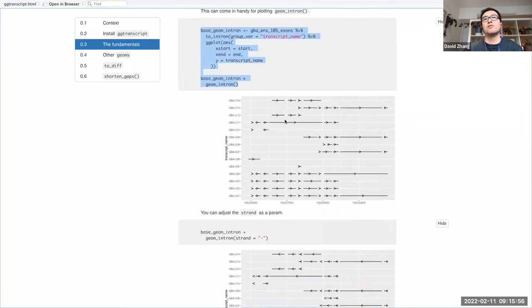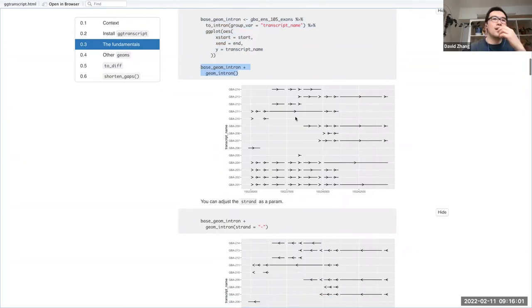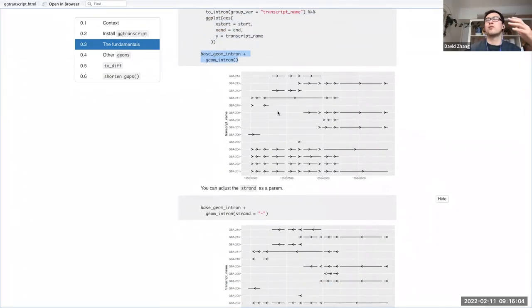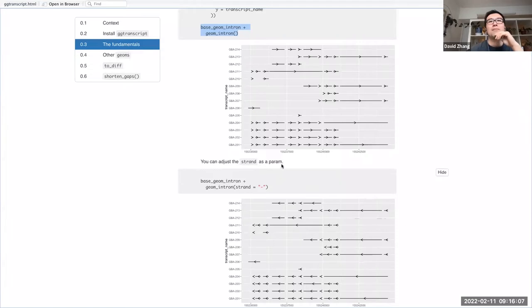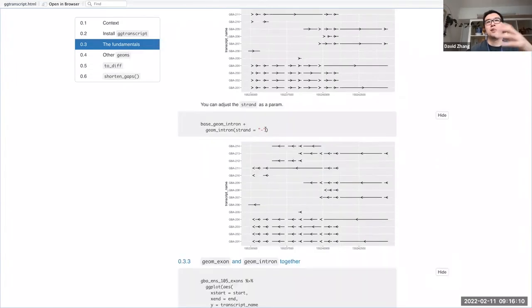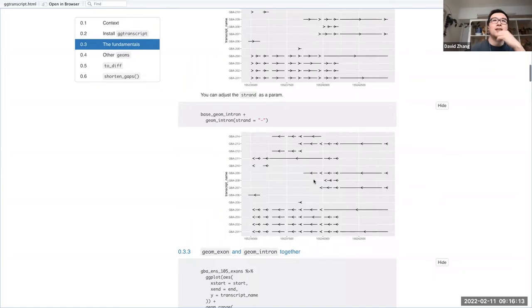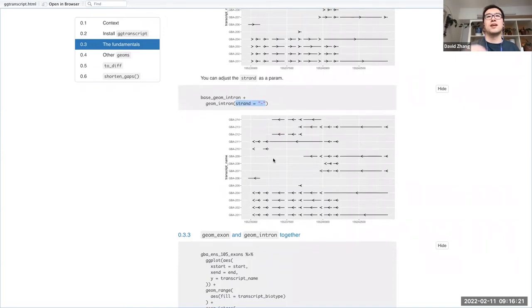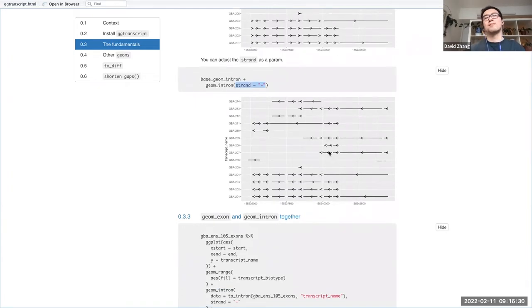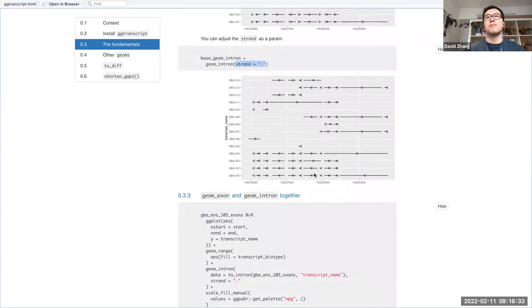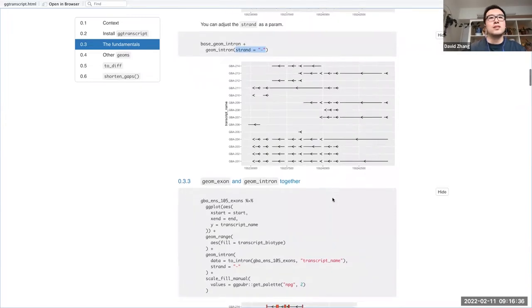Here I'm showing what the base level of geom_intron looks like. By default the strand arrow is plotted as plus, but this can also be used as a parameter to adjust the direction of strand. You can also add this as an aesthetic, mapping it to the strand column of your data frame — useful if you have transcripts originating from different strands, so one could point in the minus direction and the other in the positive.